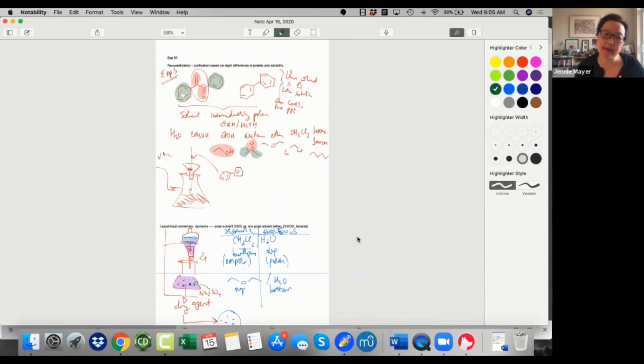And then if we were in the lab, you would use that procedure to do the lab and see how successful you are. So you will have 3 compounds in your mixture, and I will assign you each a specific one. And then you will design a process where you use both of these techniques together in order to separate the 3 compounds from each other. You would submit to me 2 of those samples, and you tell me what they were. So at the end, you need to tell me what sample you have at the end of this procedure, and then you do what to it, and then how do you get that second sample, and what is that second sample? Any questions on the objective that I just detailed now?